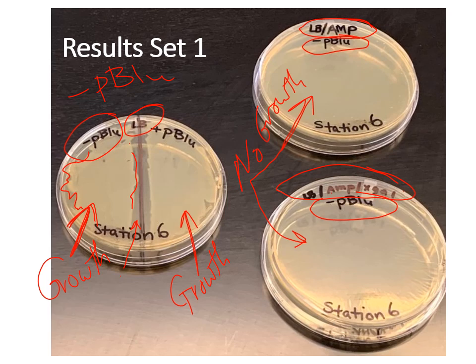Make sure, for instance, when you are analyzing results set 1, you talk about the LB plate, the LB amp plate, and the LB amp XGAL. You talk about the fact that they are minus P blue. Now notice this LB plate also has half that has the plus P blue, okay, but that's for the separate analysis, so don't worry about that half on result set number 1. Focus on the minus P blue. Describe what you would have expected, what you got, and whether or not it's the same thing.